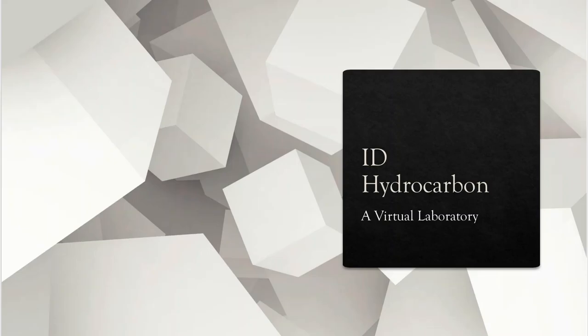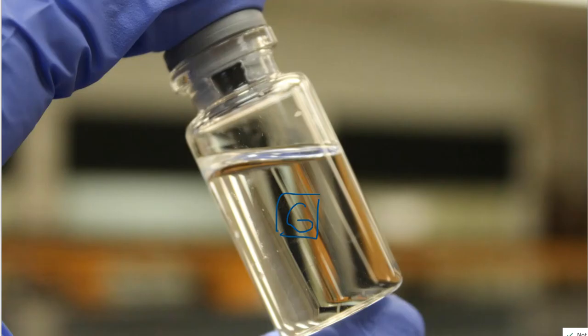So that is the ID of the hydrocarbon, a virtual lab. All right, so use those 3 values that you've now discovered when we did the lab together, and then compare those values to the table that's in the lab procedure, and you tell me, out of those possible choices, which alkane, which hydrocarbon, did I pull out and put into this bottle? I hope that you can identify it the correct way.